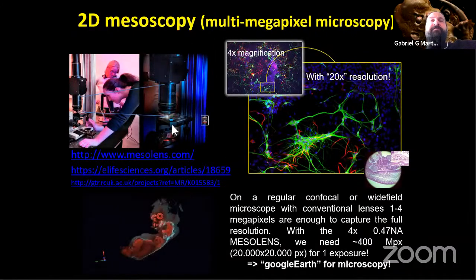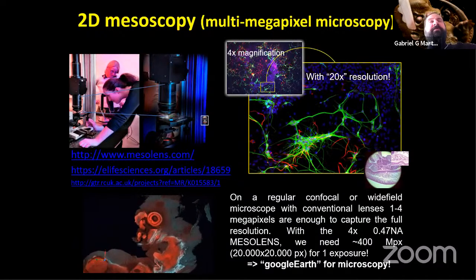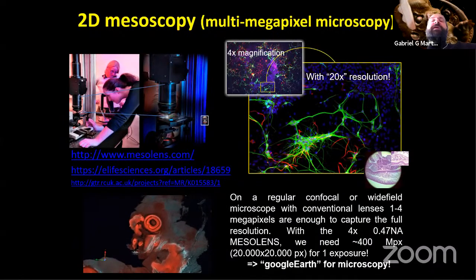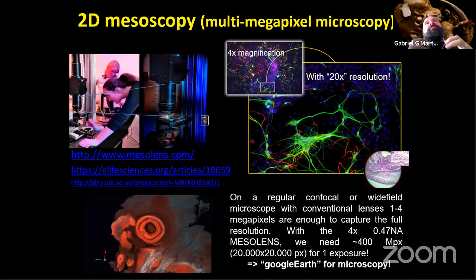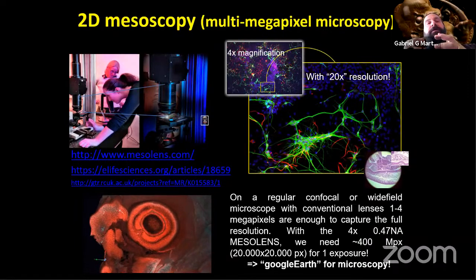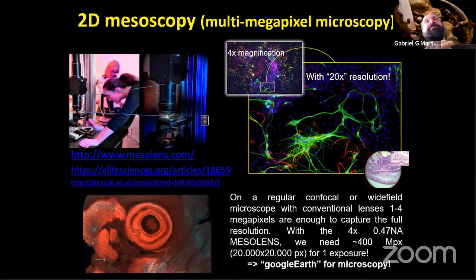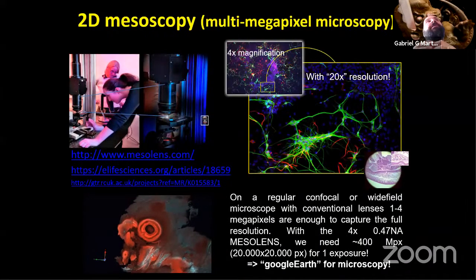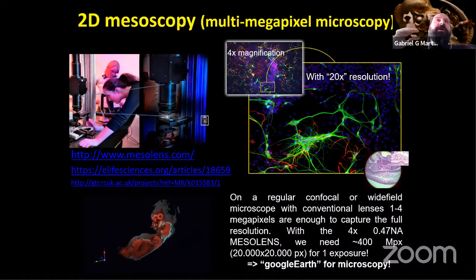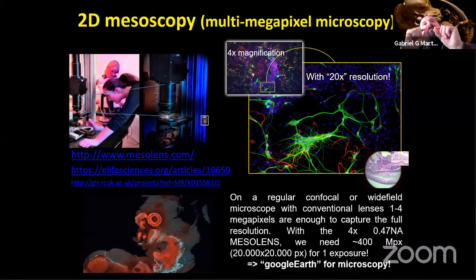And this is, I believe, very much the future for some microscope techniques, where you get low magnification objectives but with a much higher space bandwidth product. It's a concept different from resolution. It's in fact how much information an objective can give you, given the full field of view that you can attain with that objective. It turns out that high numerical aperture objectives, like the ones typically used in confocals, can give you the maximum resolution that you can get according to the physics of light, but they can only do that on a very, very small field of view.